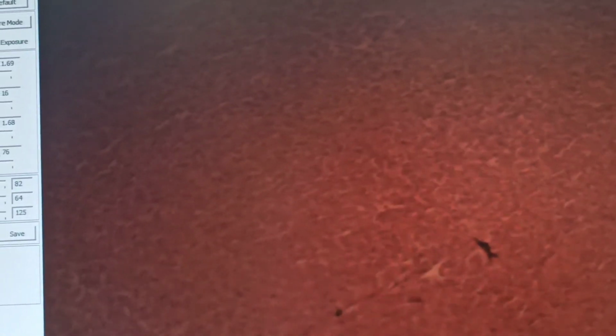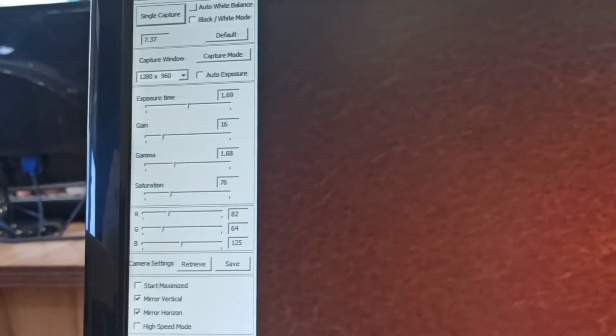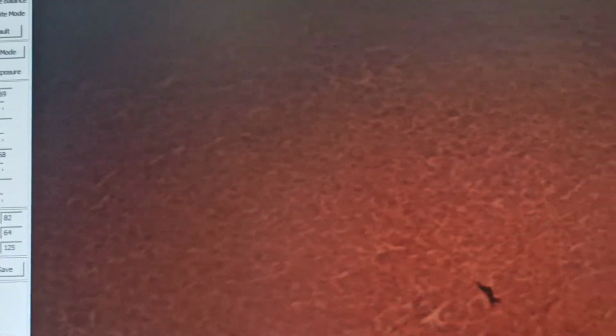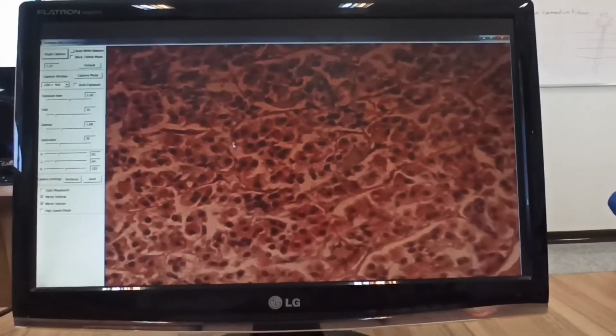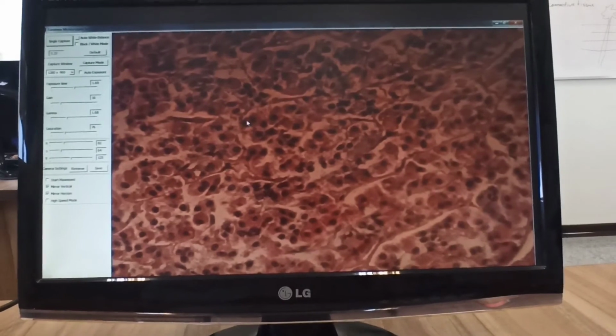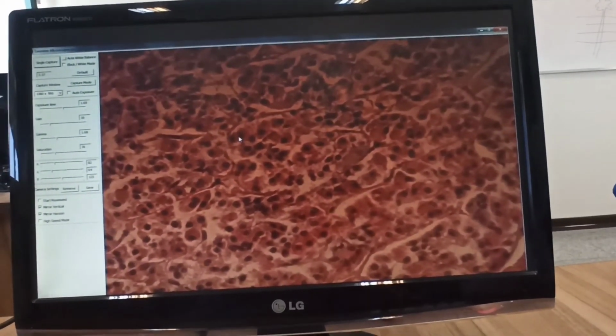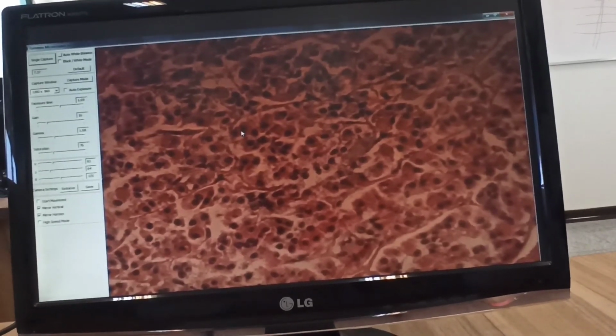As can be known from its name, acidophils are more eosinophilic. It is red. Okay. If I go to the bigger magnification, do you know what this is? I said the red cells are acidophils from chromophil cells in adenohypophysis.